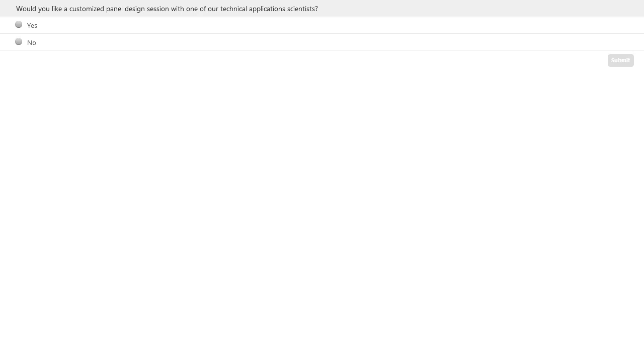So the question is really good: is it going to change our field? And I'd say in many ways, yes, it is. It brings great advantages to us in some cases of ease of use, being able to break apart colors that are very close to each other.